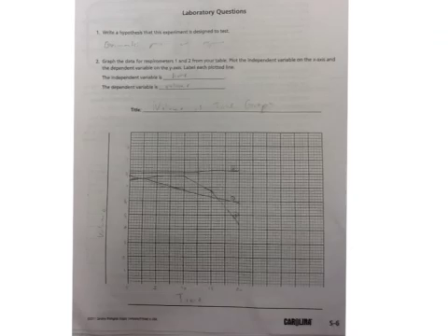Lab questions. Our hypothesis for this experiment is that the germinating peas will respirate. Our independent variable is time, and the dependent variable is volume. Here we have a volume versus time graph, and it shows all of our data. Then we have all the variables and the controls we had.